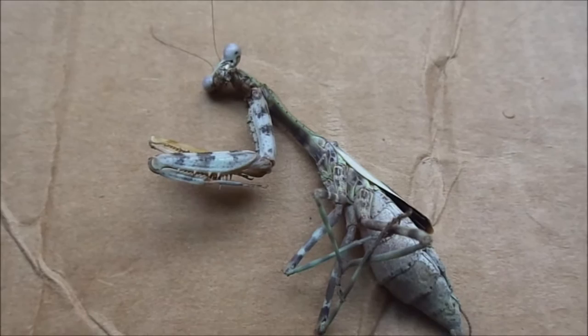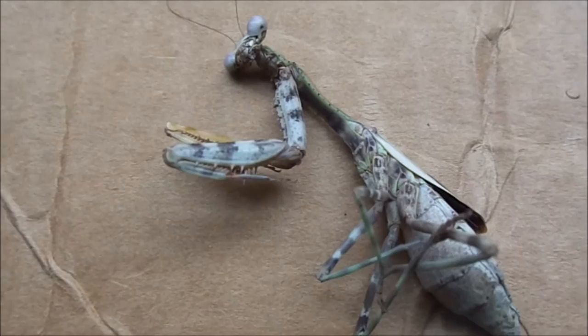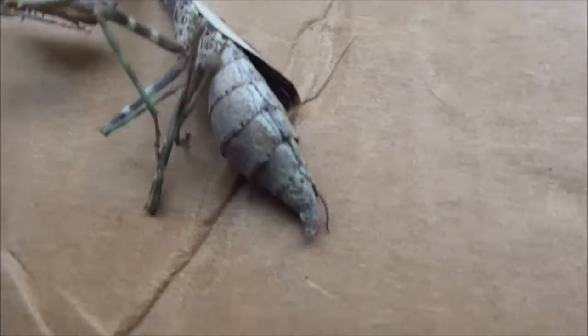Hello, I'm going to just get started with the dissection of this. It is Parasphendale agrionina — the Budwing Mantis. This is a female, approximately eight or nine months old. Not totally sure because I got it when she was already an adult, so didn't track any molts after that.